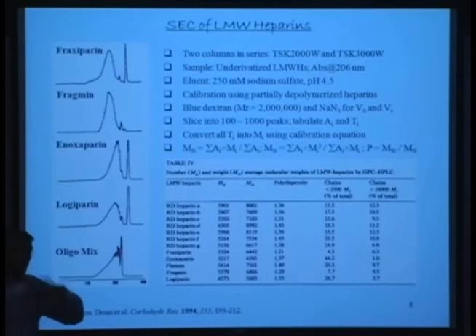But as soon as we generate heterogeneous species, some chains are big, some chains are small. If you have, for example, here, a disaccharide with this species, which is a huge thing, you have considerable polydispersity. What do I say? Oh, this is not listed here because this is the reference. But in essence, you have considerable polydispersity here. So for such samples, MW is a more accurate representation of the average composition that should be considered in all interaction analysis. Okay? Basically, it's a weighted average. It's a weighted average, absolutely. It's a weighted average. Okay?